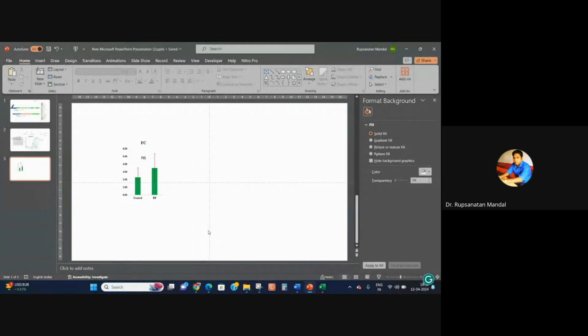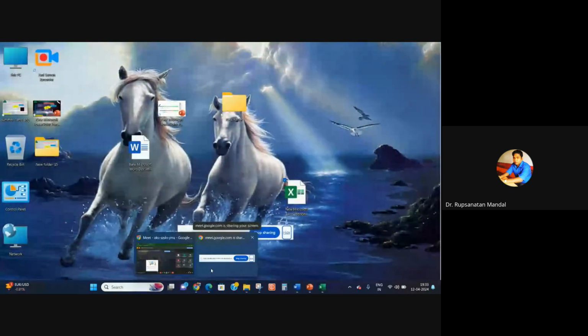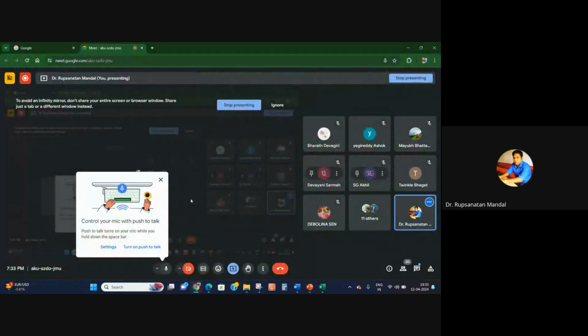So this is all about qPCR designing and qPCR data analysis. I think it is quite tough compared to other analyses. But if you have any queries regarding this, please ask. Or if you have any doubt regarding the analysis, I can do it again.